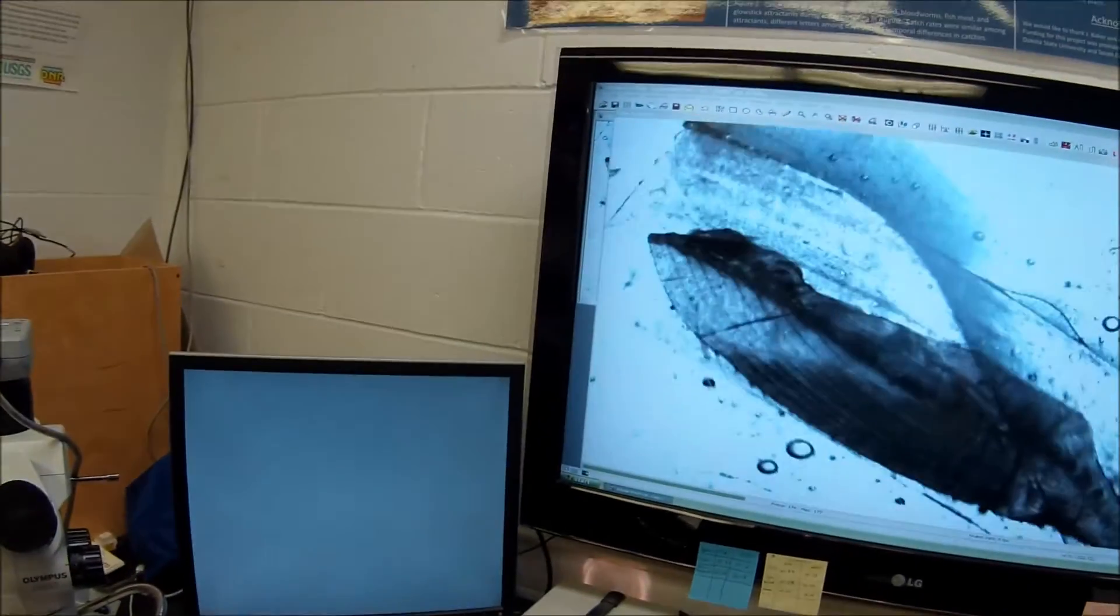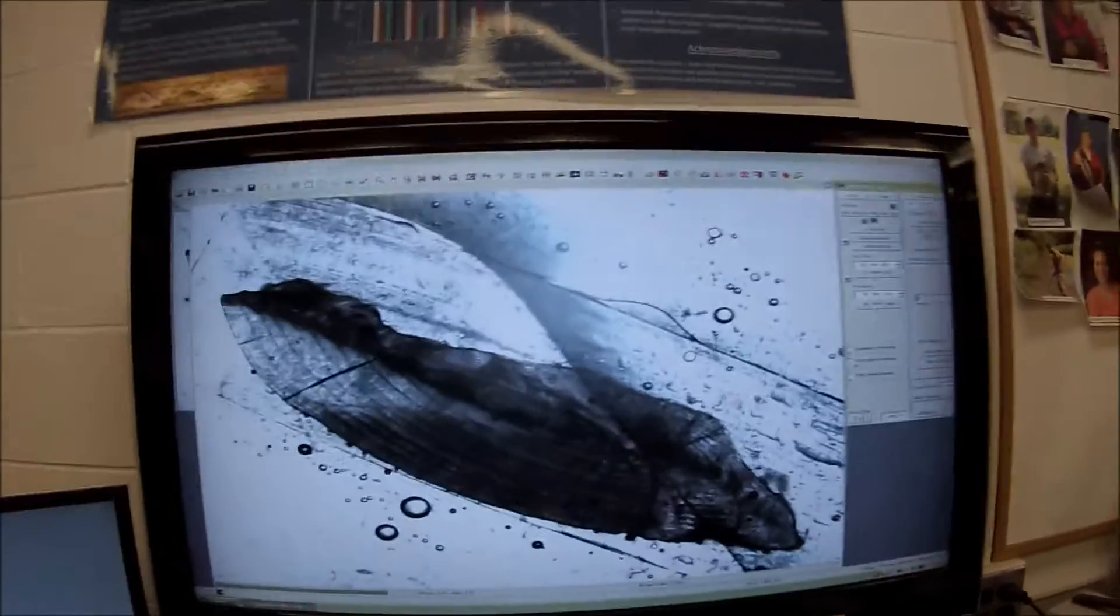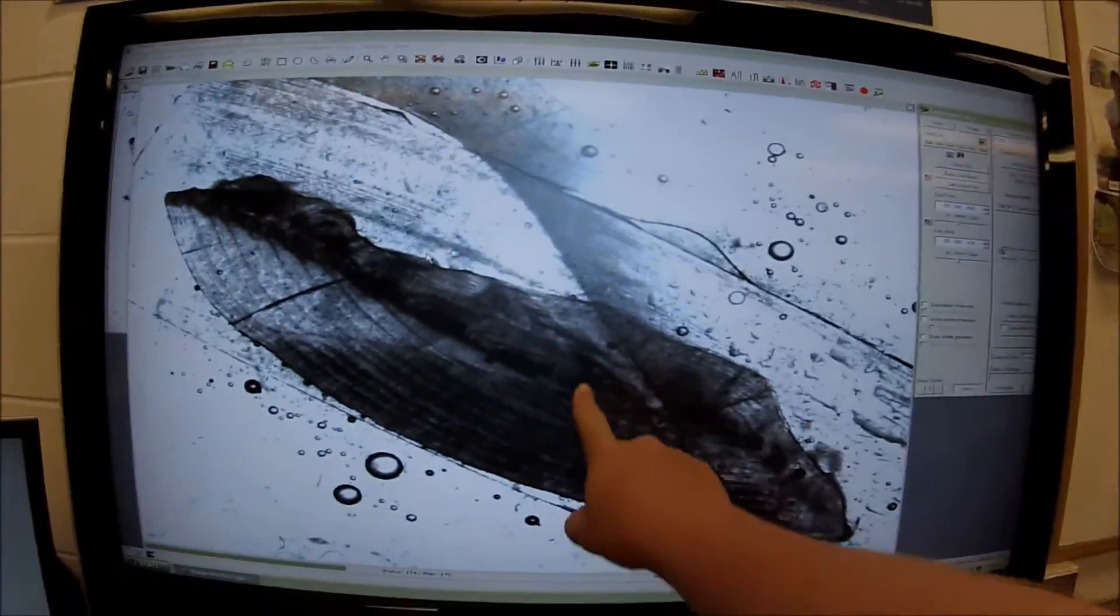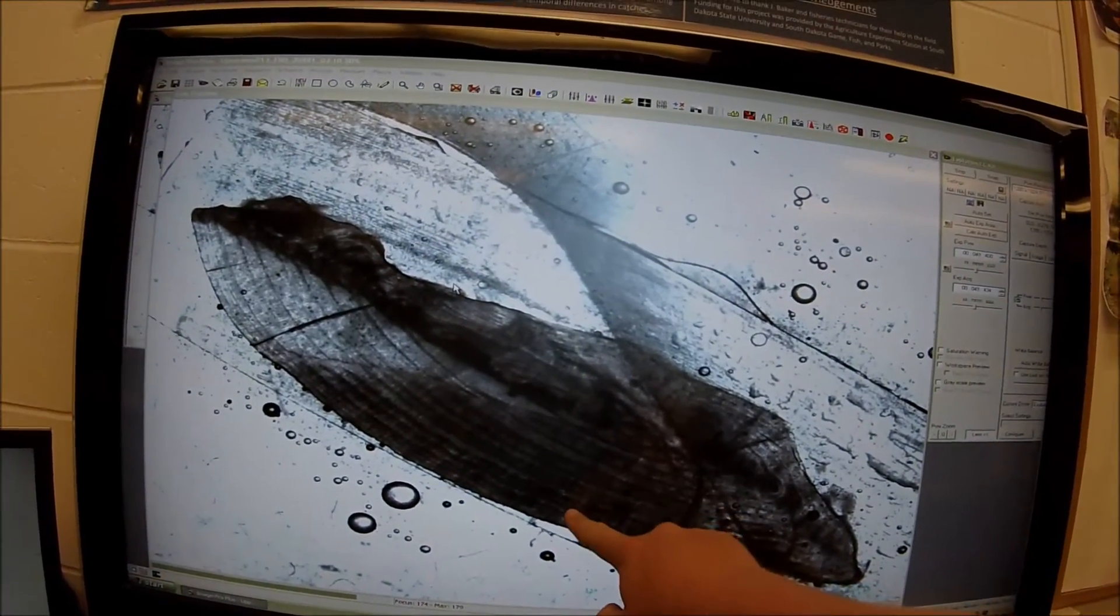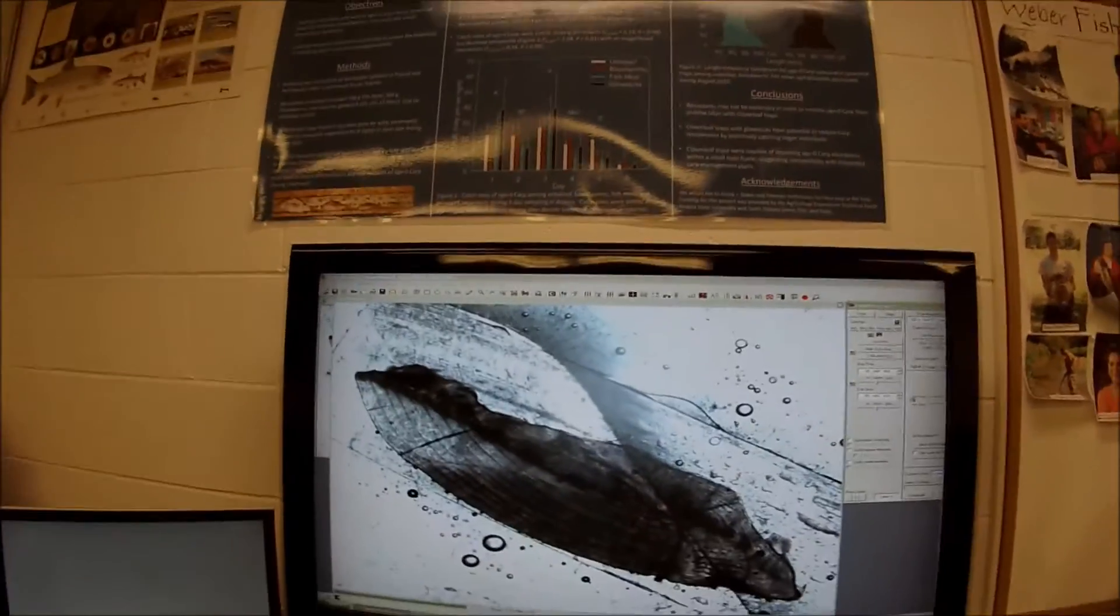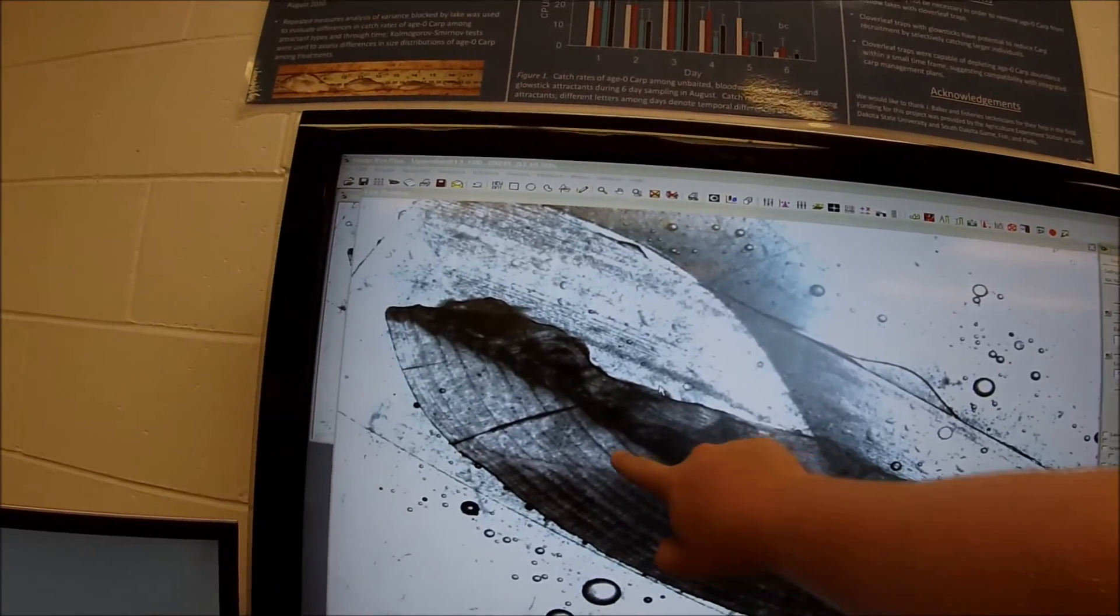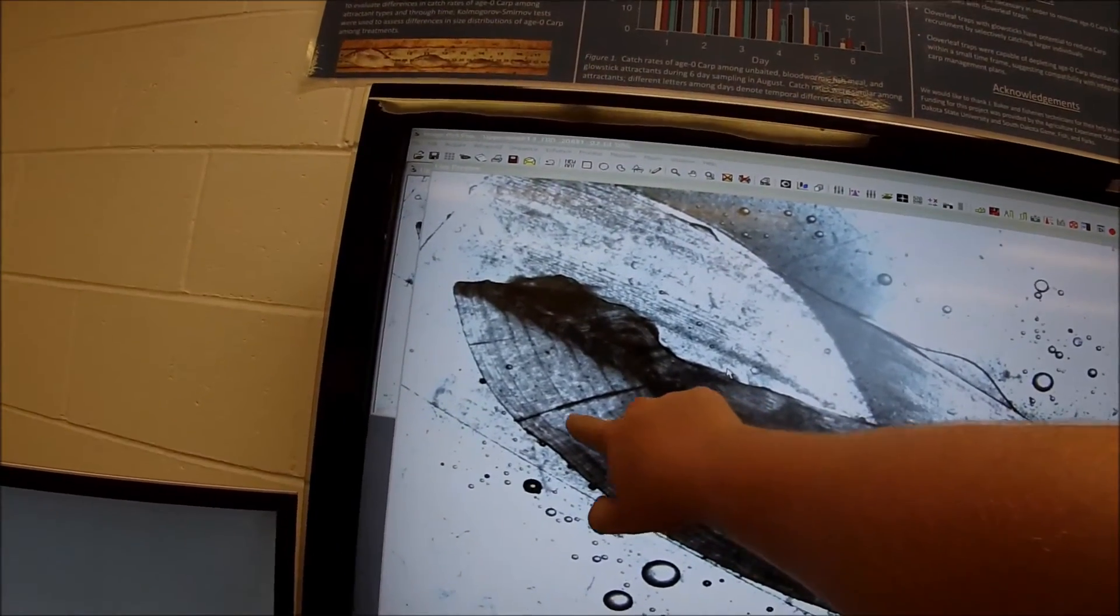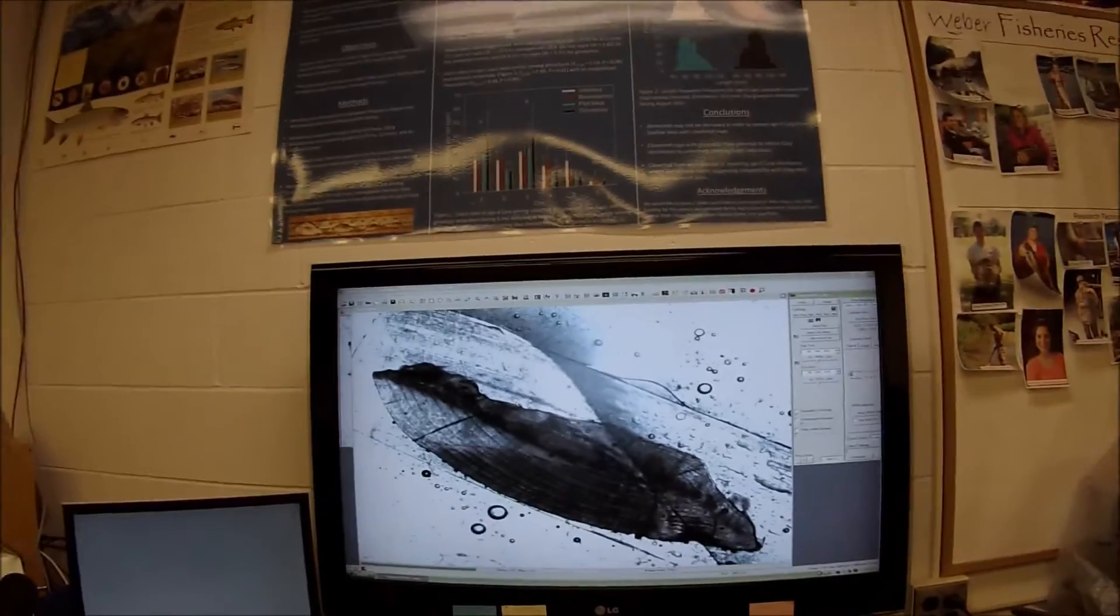Let's take a look at another one here. Oh yeah, another nice old one. Let's see. Nucleus, 1, 2, 3, 4, 5, 6, 7, 8, 9, 10. About 10 years old. Nucleus, 1, 2, 3, 4, 5, 6, 7, 8, 9, 10. Yep, about 10 years old.